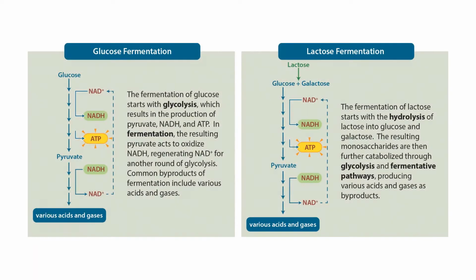Phenol red broth is commonly used to measure bacterial fermentation. In this video, we'll start with the fermentation of two common sugars, glucose and lactose.